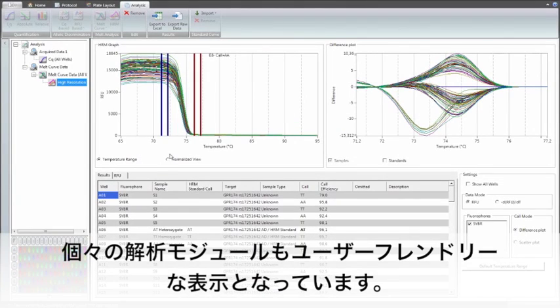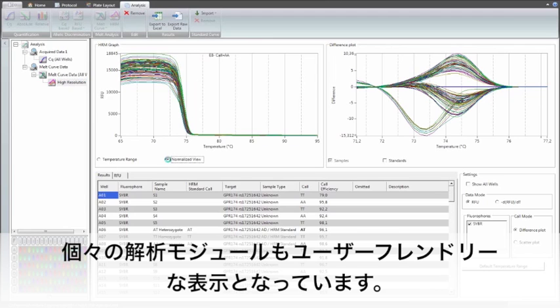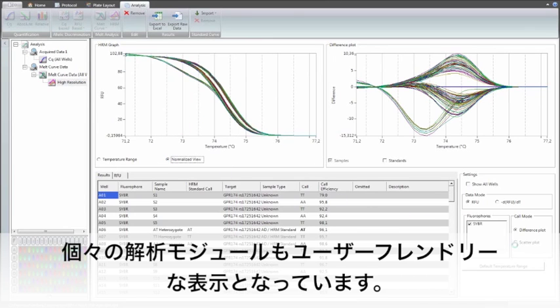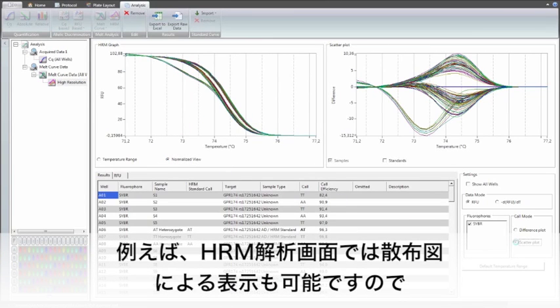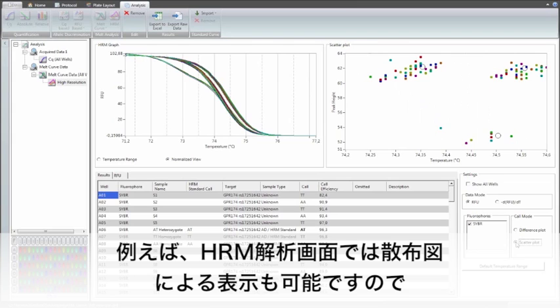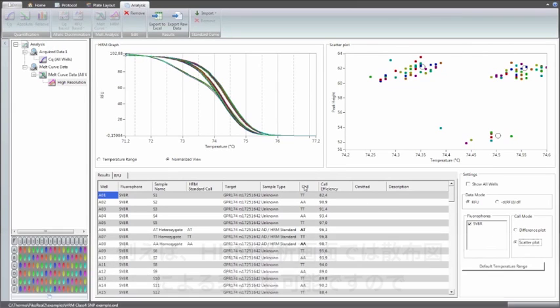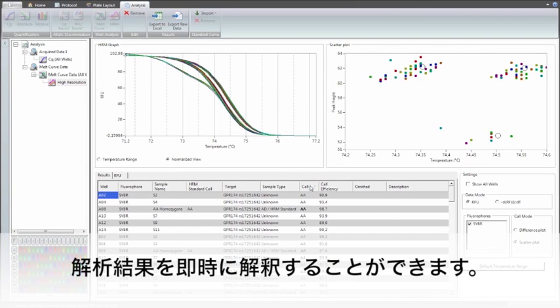The individual analysis modules contain user-friendly and visual features, like the scatterplot view in high-resolution melt analysis, which helps to quickly interpret the results.